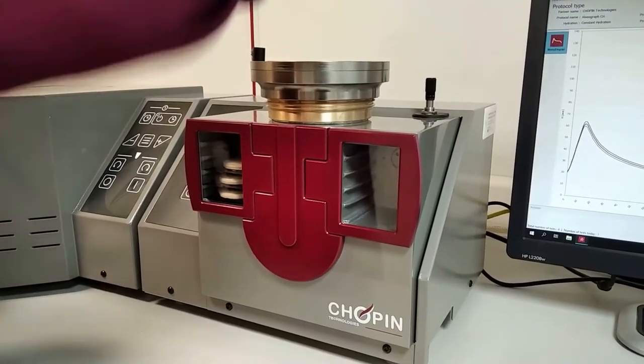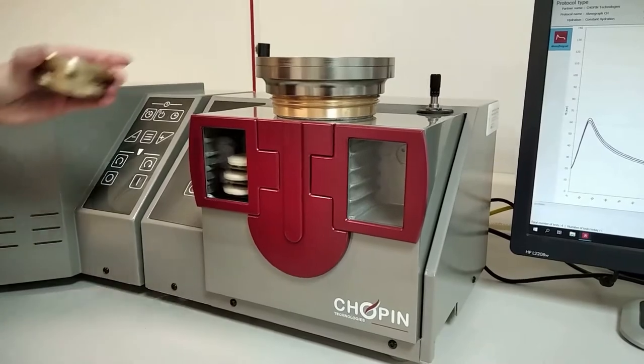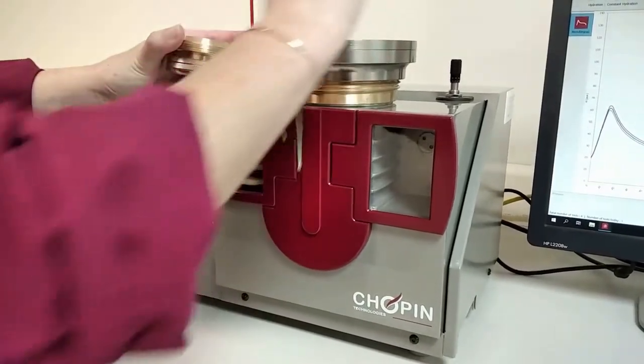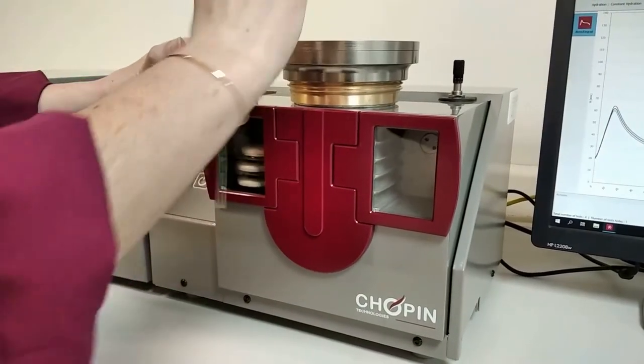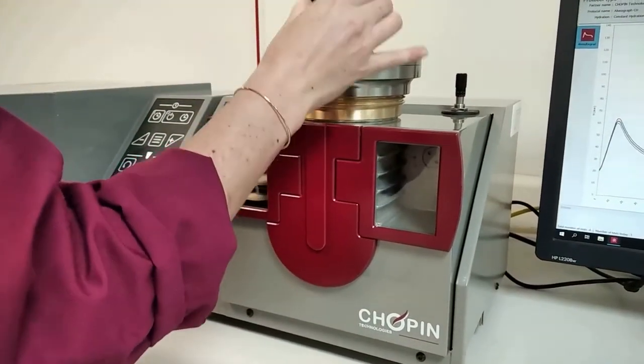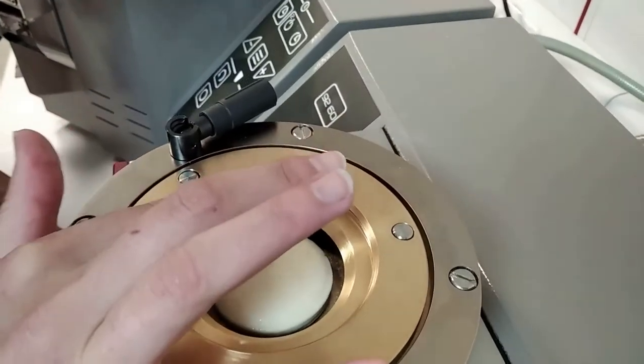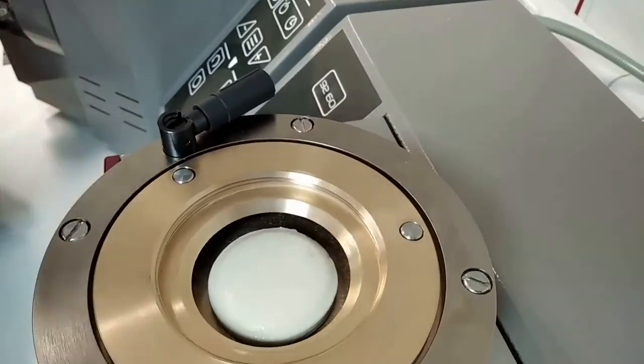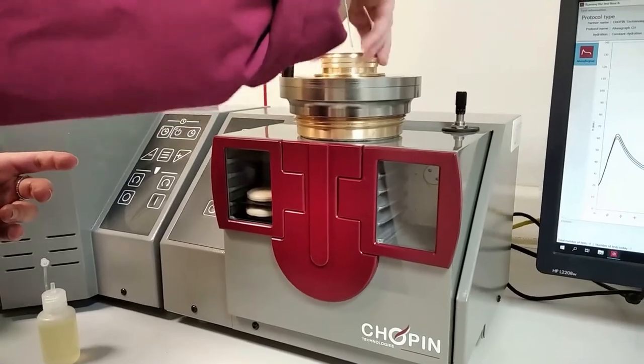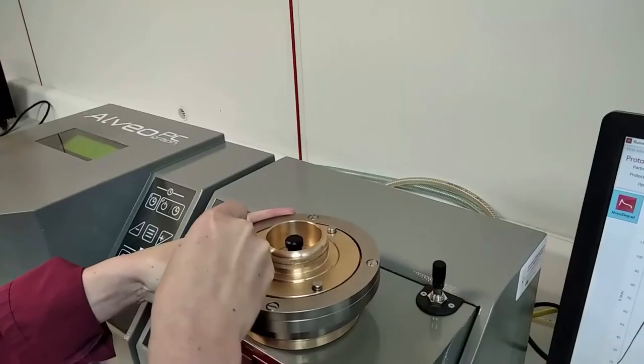Unscrew the ring and turn the tampon over. Oil the fixed plate and the tampon. Slide the dough piece and center it acting on its edge. Replace the tampon and screw the ring back to immobilize it.